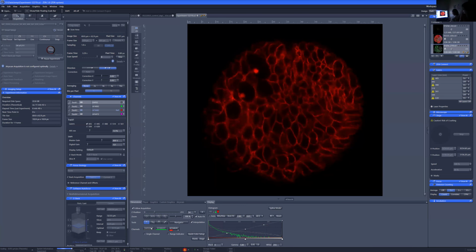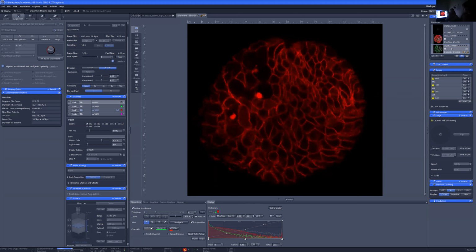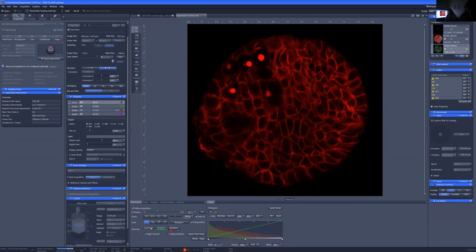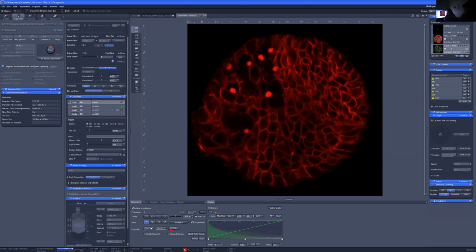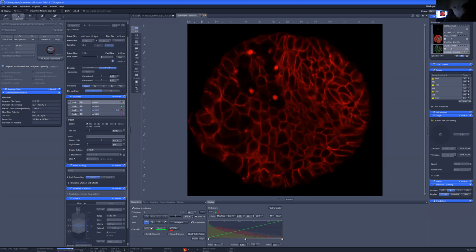Do you have the bandwidth to get back to the AI question? Yeah. In our final couple minutes, I want to talk a little about the analysis that I do after I take these images. The goal of my experiments is to count the number of egg stem cells to determine what genes control the process of making the egg stem cells divide.